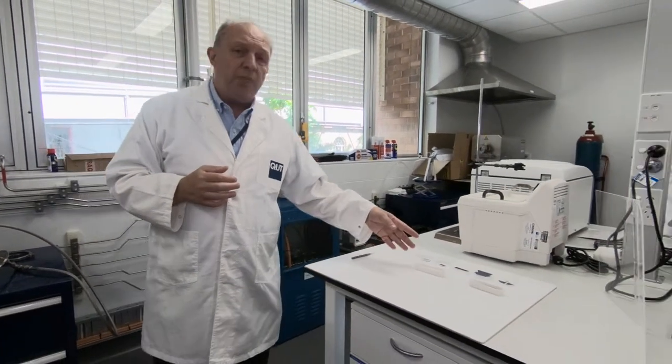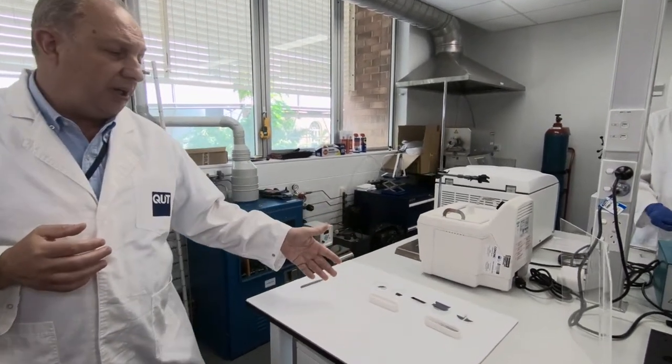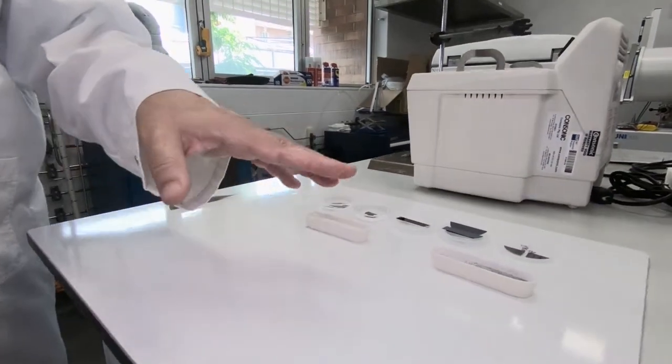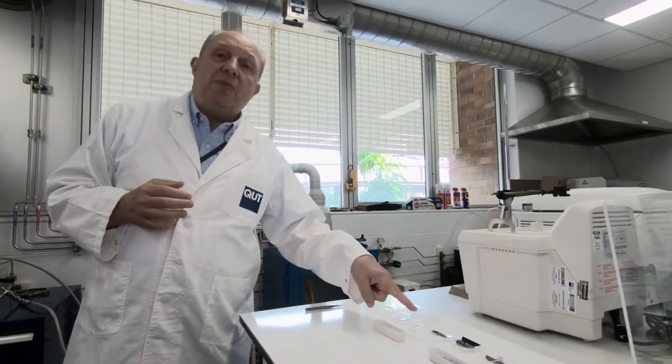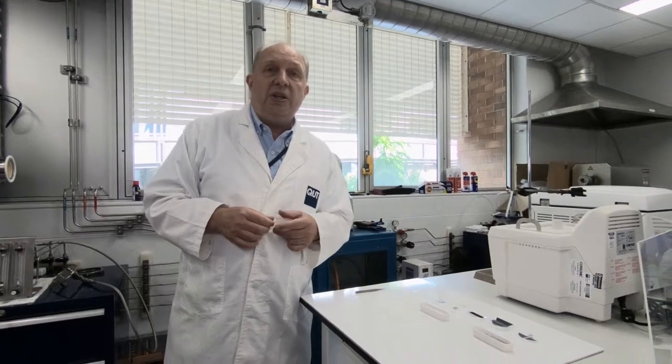And yesterday we made a try to make boron nitride nanomaterials here. You can see different components of this precursor, silicon wafers, and after the synthesis the wafer changed the color. It means we are successful in making nanomaterials made of boron nitride. And Konstantin will guide you for the rest of the procedures.